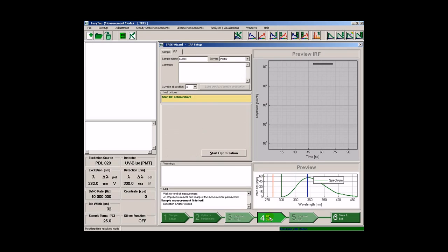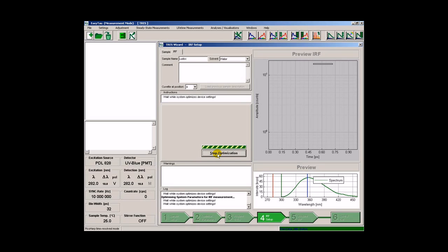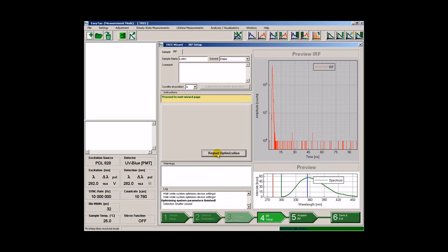so the next step will be setting up the conditions for the instrumental response function measurement. The wizard automatically moves the sample changer to position 4, which contains a cuvette with a LUDOX solution. During the optimization process, the wizard here leaves most of the settings untouched. The only element that is adjusted during this step is the emission attenuator.